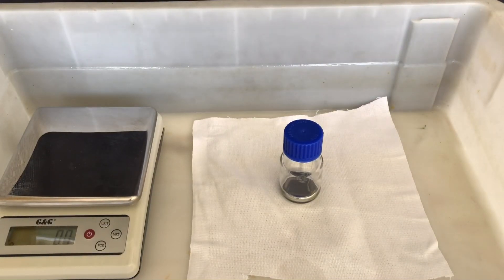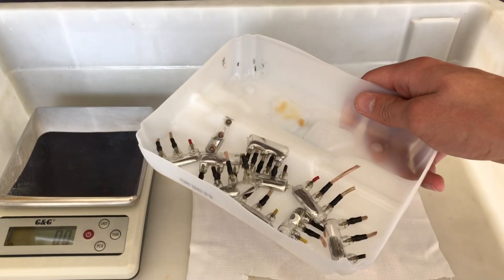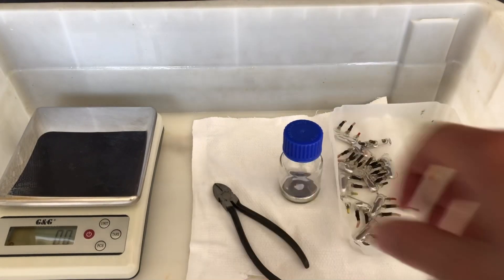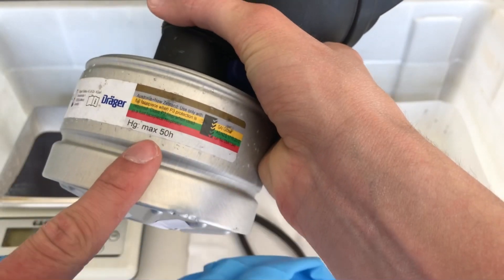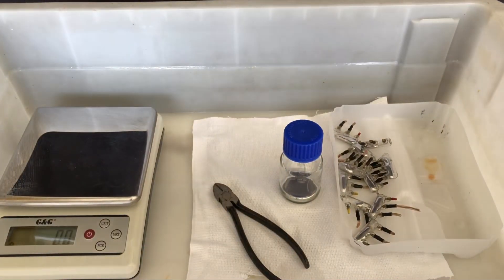Welcome back everyone. Today we are going to get some elemental mercury from mercury tilt switches. These are 10 tilt switches and you should definitely not try this at all, because mercury and its vapors are toxic. For our own safety we are using an HG rated gas mask filter and nitrile gloves.